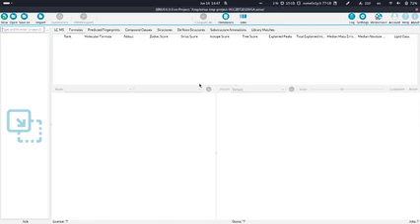Maybe just a quick question to everybody who has already used SIRIUS in the past, maybe another version. Oh, it's already really a lot of people. That's really nice. Has somebody already used SIRIUS 6 a little bit? Even that, nice. Because it's only out for a few weeks, I think. Especially for all the people who have used SIRIUS 5, for example, I will also highlight what has changed, and there are quite a few changes which probably change everything a little bit, which you maybe have to keep in mind.